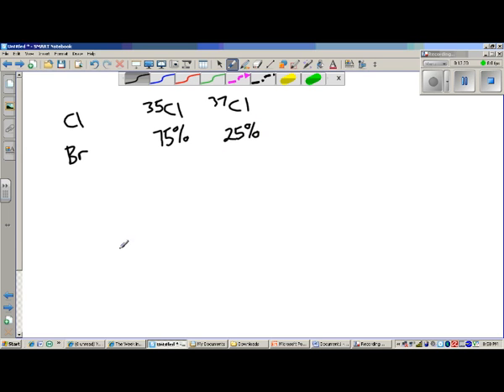And so what this means when you have a mass spectrum, that's supposed to be a straight line, and this is your mass to charge ratio along the bottom. If you have a molecular ion peak at whatever weight the molecule happens to be that contains chlorine, and then you have a peak 2 units away, so let's say this is X, and then a little later we have X plus 2.